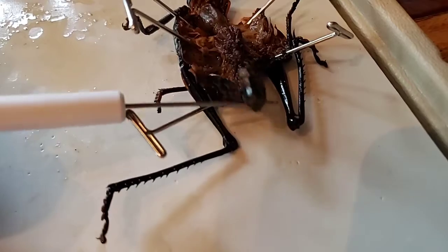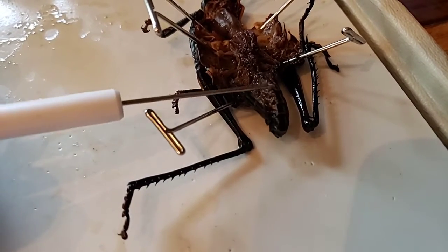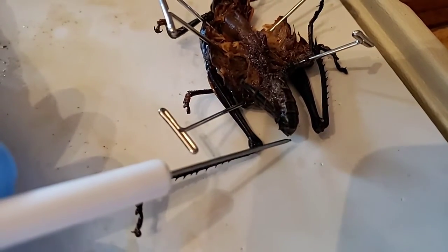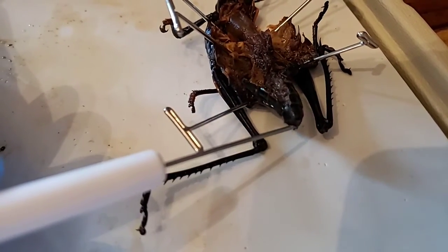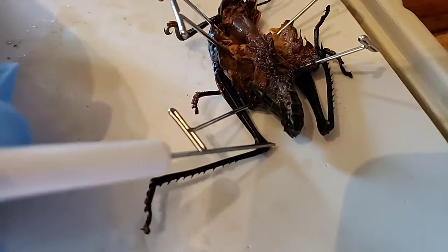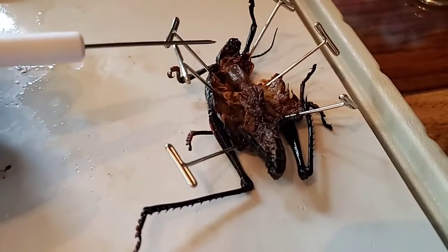You can see right down there. Put it down again, Tanley, on the white. Can you point to the four that are on there? You can kind of see the points sticking out. There's one, two, there's one down here, and there's one on the other side, and then four. So those four mean that this was a female grasshopper.